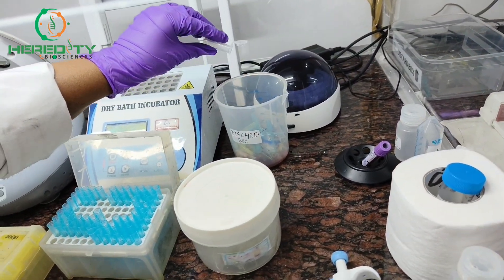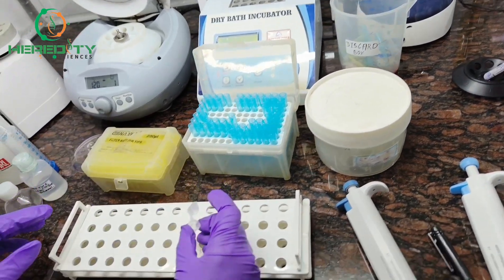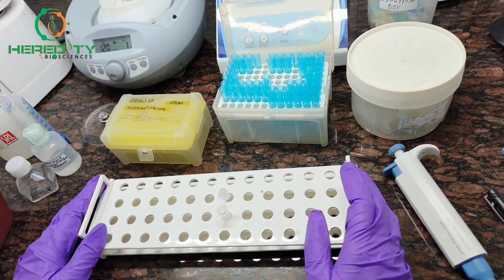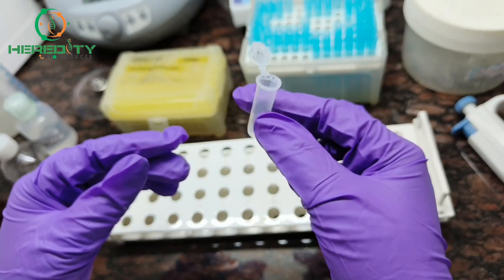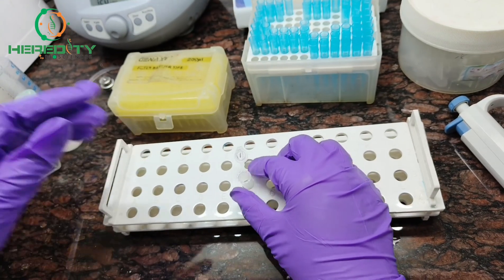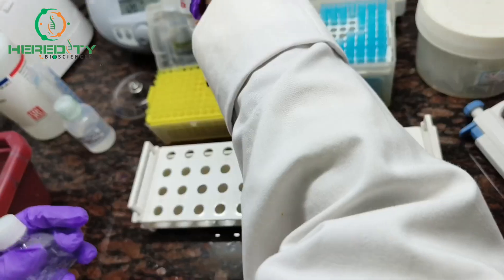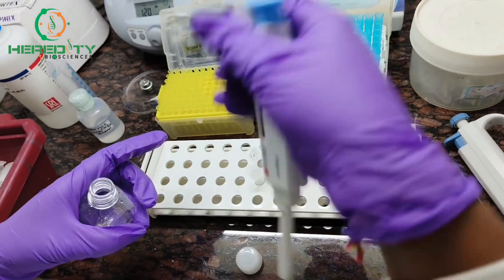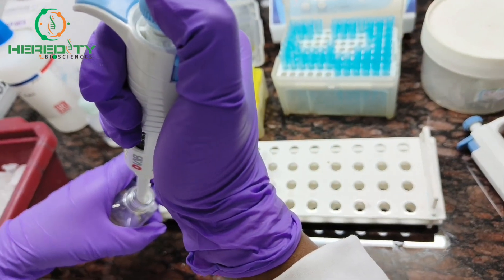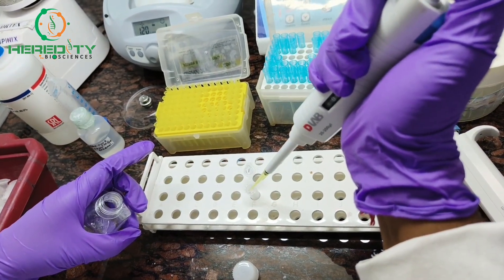Discard the supernatant and leave the pellet to dry at room temperature for 1 to 2 hours. After complete drying, add 50 microliters of TE buffer. We are adding TE buffer — that is our elution step.